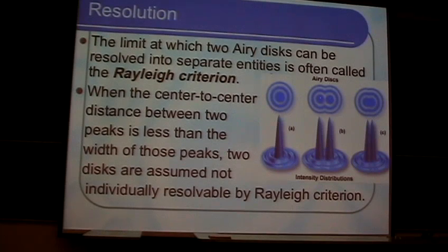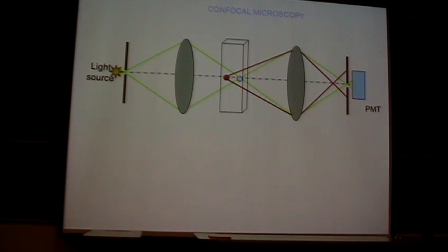And vice versa, if the distance between the centers of peaks is larger than the width of those peaks, then we can resolve them, as shown in this illustration.